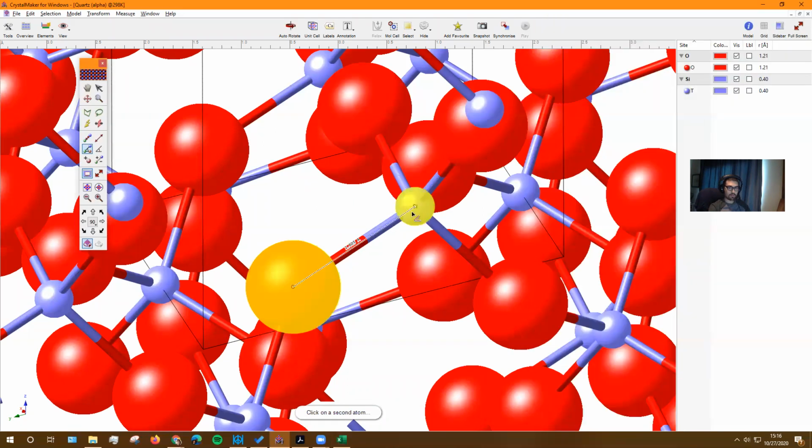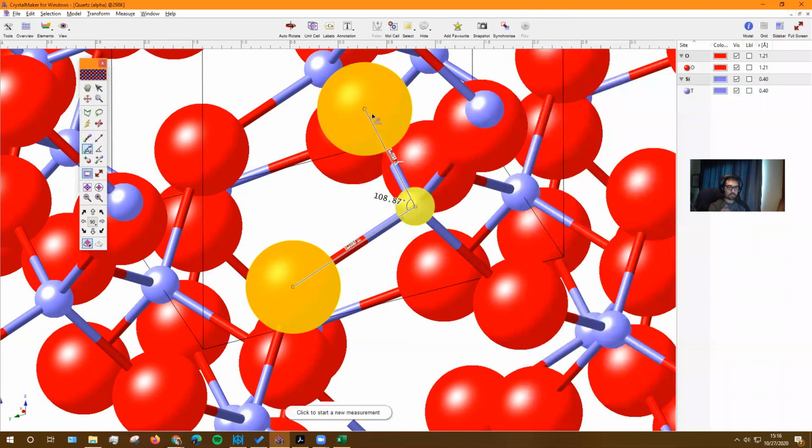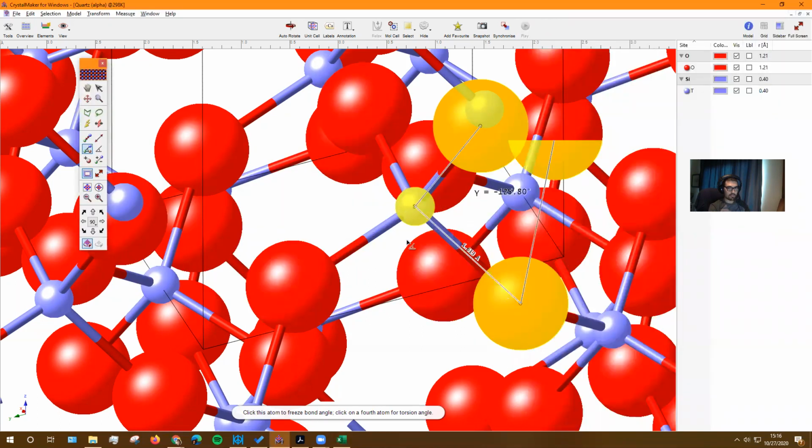We'll go down here to the middle, up to the first one, 108.87. You can see it's freaking out there because I didn't click again. Make sure you click again. Okay. Now we'll go here, down there, to this corner, 109.27. I didn't click again. You see if I was to move my mouse around, it'd be freaking out. So I'm going to click the atom again before you move on.